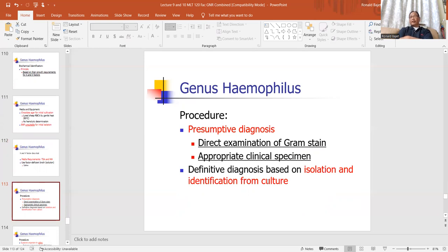When you're reading, because Haemophilus influenzae is a respiratory culture, you get a sputum culture or bronch wash or whatever, a throat culture. You want a culture and you're not looking for group A strep. You take a look at your blood agar plate and your chocolate plate at the same time. You lift both plates up and look at them. Because it's the same swab and the same specimen, theoretically you should get the same amount of growth on both blood and chocolate, correct? But since Haemophilus likes chocolate better than blood, when you turn the plates over and read the two cultures, that's how you actually read respiratory cultures. You turn them over at the same time. If there's more growth on the chocolate plate, then the additional growth that grows on chocolate and not on blood is possibly Haemophilus.